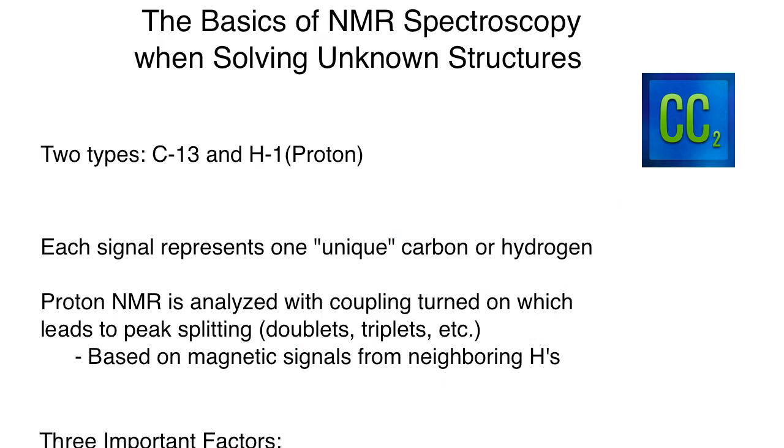Alright everybody, so this is the 6th lecture in the series, and we are finally ready to break into NMR spectroscopy. So the way that I'm going to outline this is that this 6th lecture is going to be a general, and I do mean general, overview of NMR spectroscopy. I do have more detailed videos if you're interested in learning in great detail about spin-spin coupling and the splitting of peaks. If you're interested in learning about how NMR works, why chemical shift behaves the way that it does, there are videos on the channel that explain all of that.